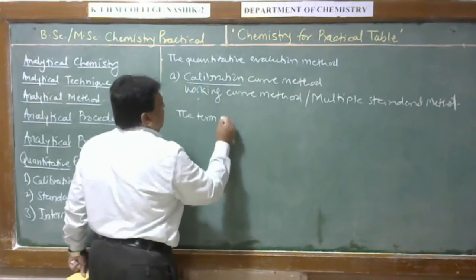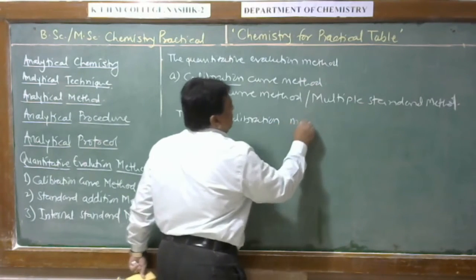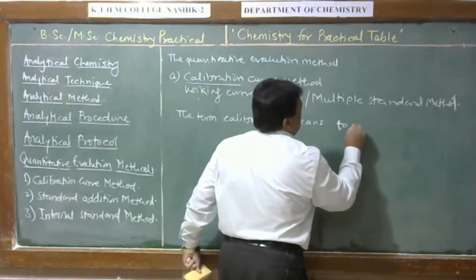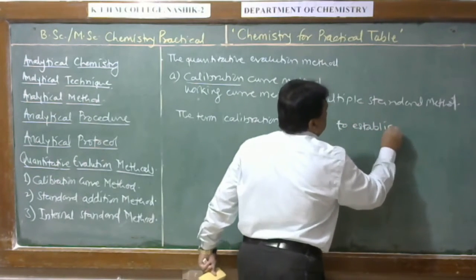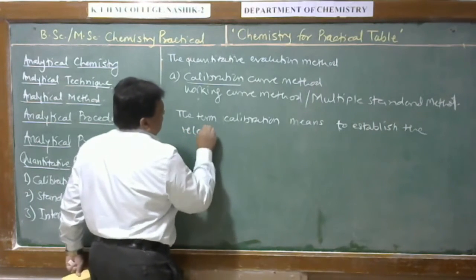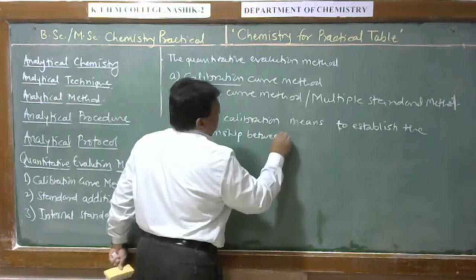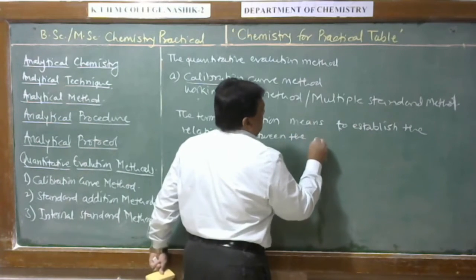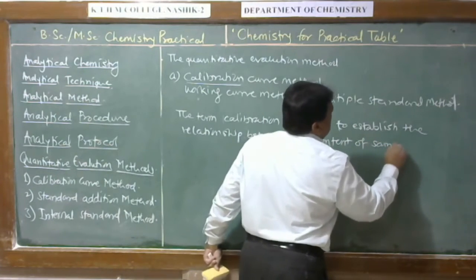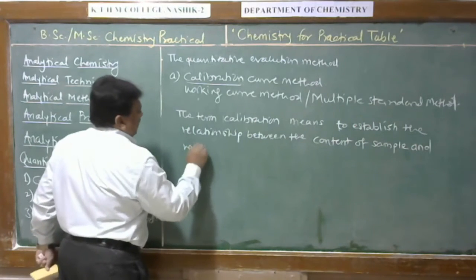The term calibration means to establish the relationship between the content of sample and the response of the instrument.